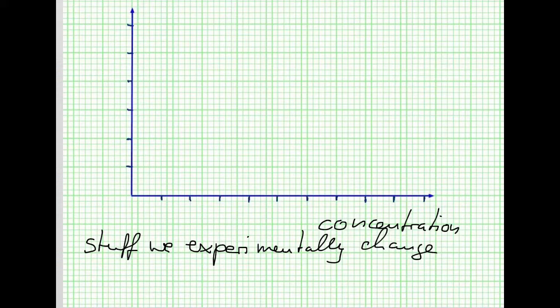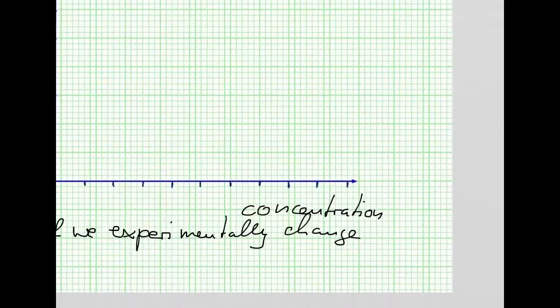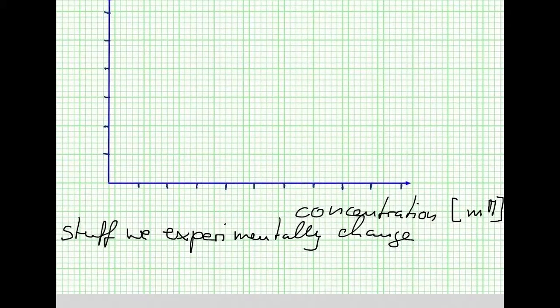And we also, absolutely essential, we need to know what units this is. Yeah? So, concentration, and in our case we said this would be in millimolar. If there's no unit, I don't have a clue what it means. Forget it.